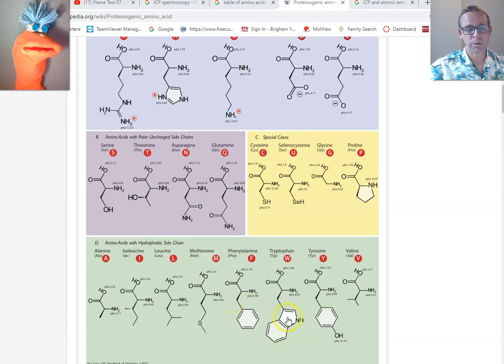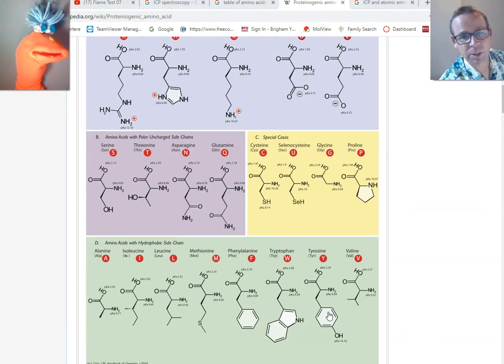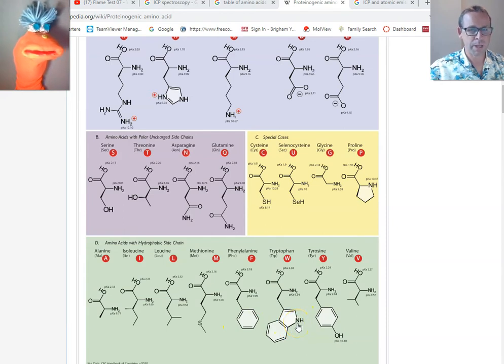And these molecular orbitals then have the ability to absorb energy in more regions than a simple chemical like alanine, right? So phenylalanine, tryptophan, and tyrosine are our amino acids in proteins that cause them to fluoresce. And again, what that means is these molecules absorb energy and then re-emit that energy in the form of a photon, and it's a very particular wavelength.